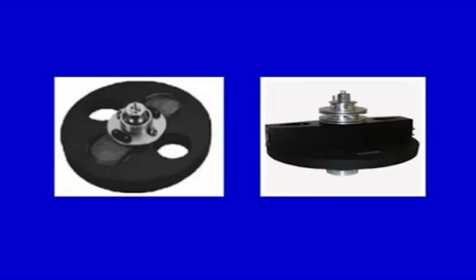In real life, it looks something like this. There is a big rotor on one side, like the elutriator rotor we have described. The continuous flow rotor also has applications in different areas or for different separations.